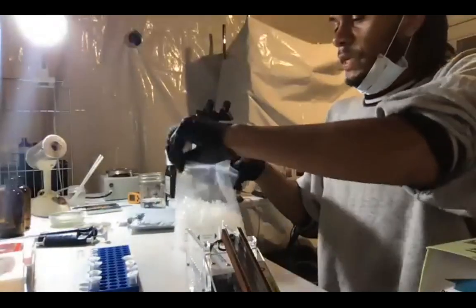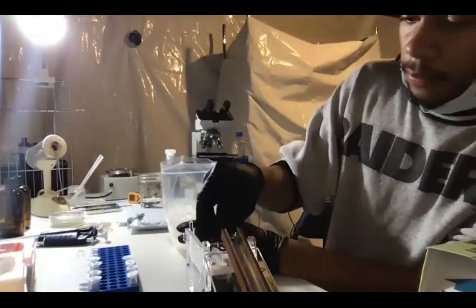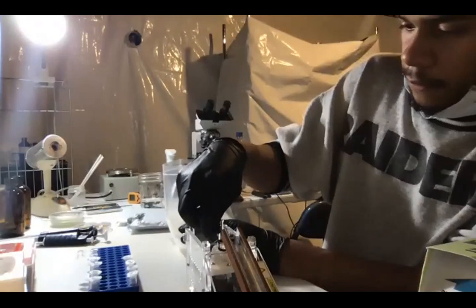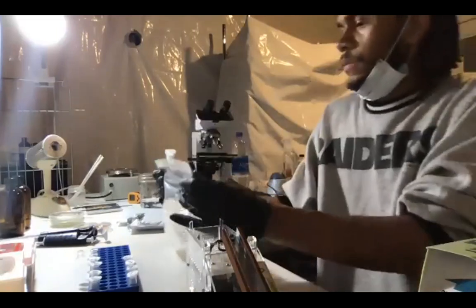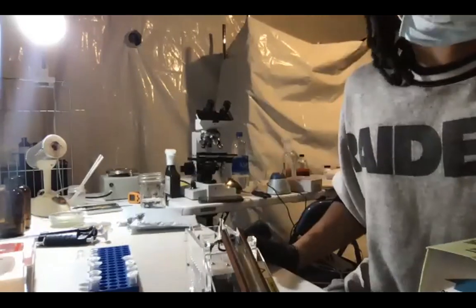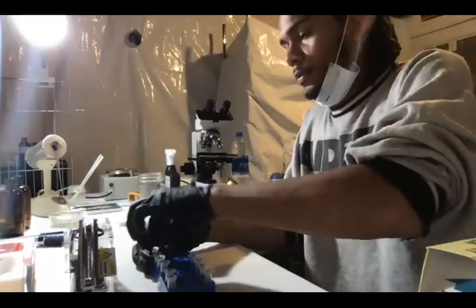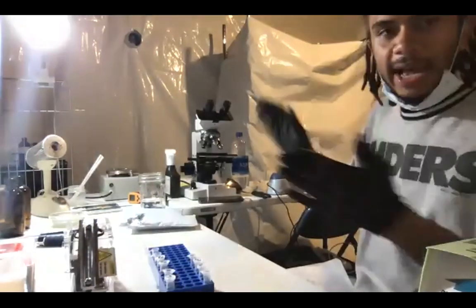I'm gonna get these in here first before I make my mix, because you kind of want to move fast after you mix the master mix with the primers and everything, because it's gonna start the reaction. Set this aside. I'll put this behind my rack here. I'm gonna close these and just label it. I don't really need to because I can remember, but I'm just gonna put one and two on this. I spray my hands down just because it's a habit at this point.